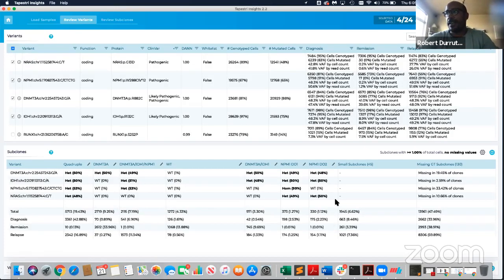That's a very good question. Not always, because it really depends on the overall makeup of your clones. In most cases, your pair that results in the wild type call, where you are unable to amplify the mutant allele, that clone is part of an existing clone that you already have specified as true. For instance, this clone here could very well be a dropout of this clone as well, right? Where you just fail to amplify the mutant allele and you end up with NRAS wild type.